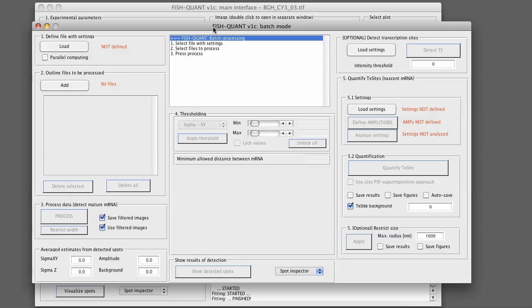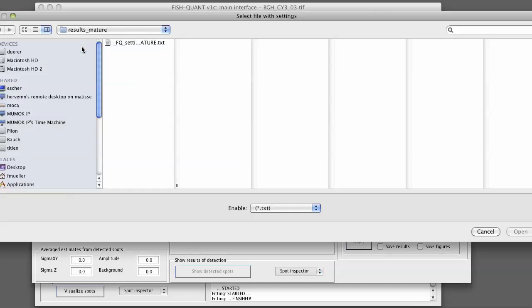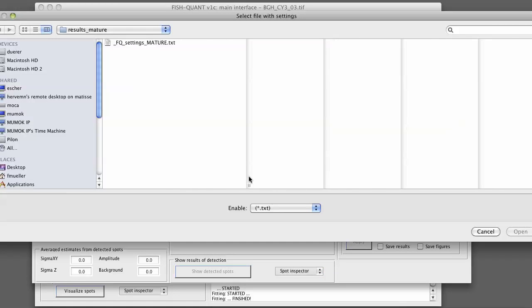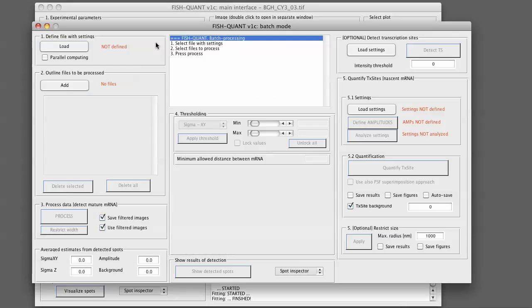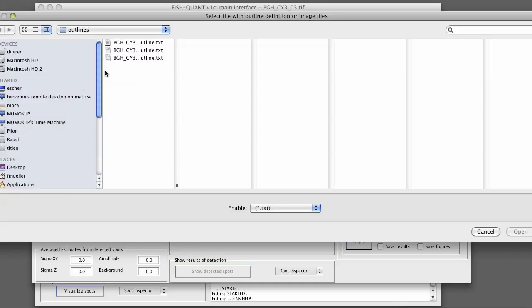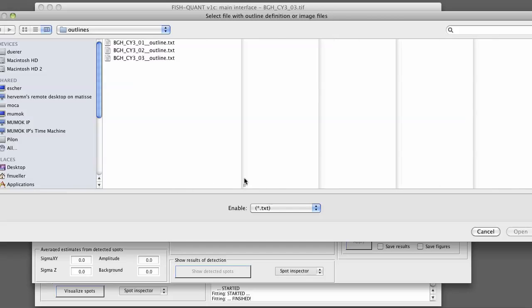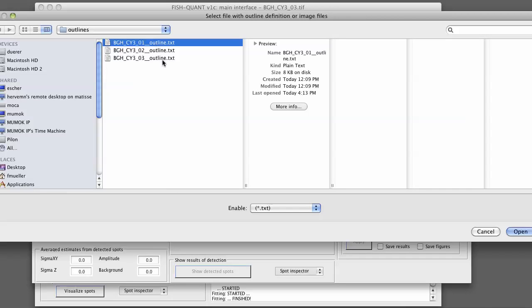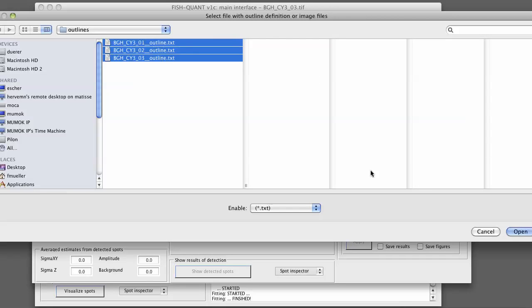What we now do is we simply load the detection settings that we defined before. So we go here load. Load the settings that we defined before. We also perform the parallel computing again so we simply check mark this item here. And here we now add the different outline files that we want to process. We go to add will automatically go to the outlines folder. We add those outline files.